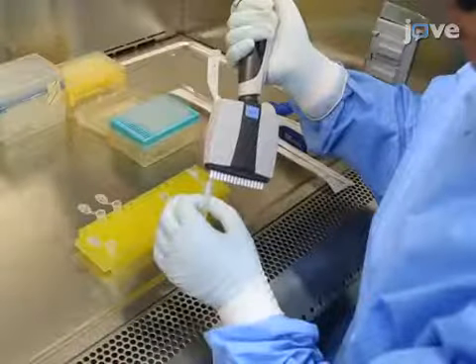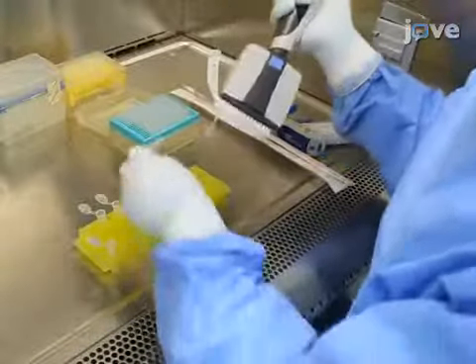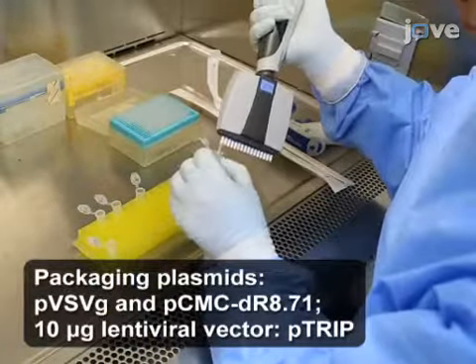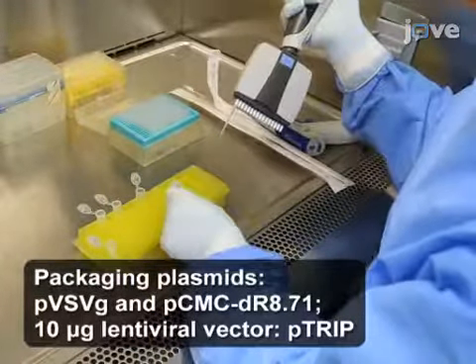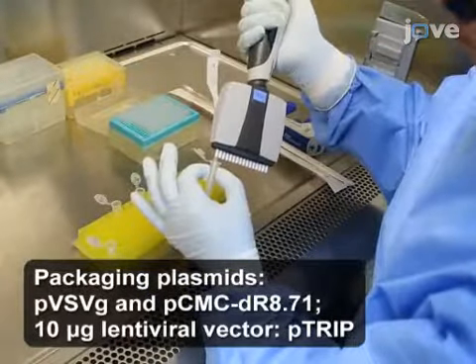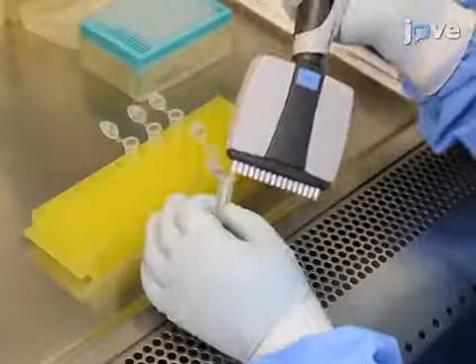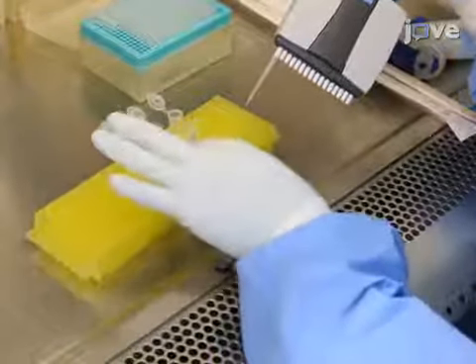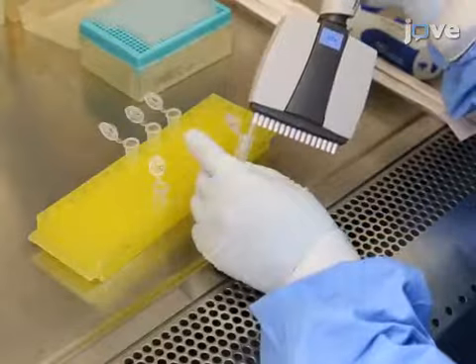On the following day, prepare DNA transfection solution with packaging plasmids, lentiviral vector, 125 microliters of 1 molar calcium chloride, and add distilled water to adjust the volume to 500 microliters. Gently add 500 microliters of 0.05 molar HEPES buffer and incubate for 10 minutes at room temperature.